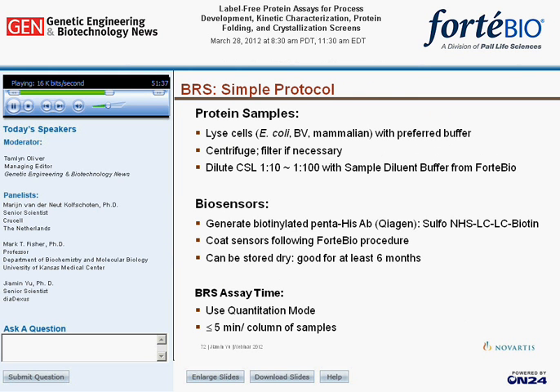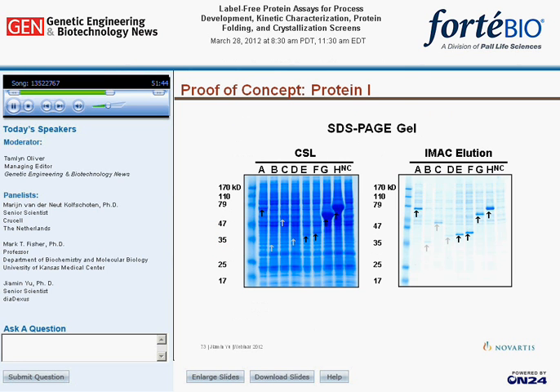With the huge amount of historic data on protein 1, we had a perfect opportunity to test the binding rate concept. The image on the left is the SDS-PAGE gel of crude soluble lysate from 8 constructs that are representative of the constructs that were chosen for scale-up purification. The last column is the soluble lysate from a negative control construct that does not express His tag protein. The image on the right shows the IMAC elution profile, and I can tell you now that it was constructs E and F that gave crystals immediately, and the structure of F was solved. Next slide.